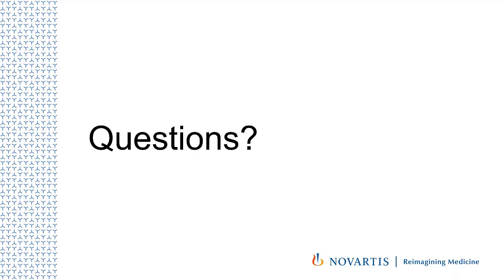Okay, another one here. So here is one. The input and output file seems complex. How long did it take you to learn and set up the processing of your data? So let's say the learning curve for the input definition, I guess. I'm not sure if I understand the question correctly.